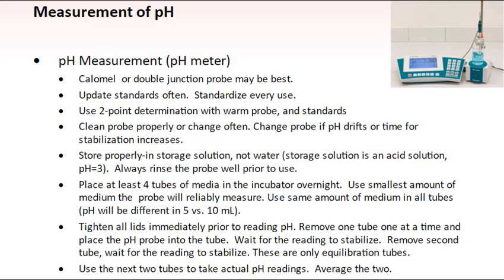Most laboratories have pH meters in them, and yet very little time or energy is taken to consider the correct use of a pH meter. The following are recommendations collected from various pH meter and probe manufacturers. It is important to match the pH probe to the application. Manufacturers of pH meters make probes that will function in lipid as opposed to aqueous solutions, at ultra-cold as opposed to room or body temperatures, etc.